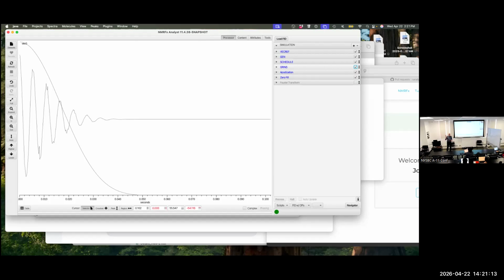So the sampling schedule, again, remember, is not the direct points in the FID, directly detected. Normally you'd collect one FID, increment, delay the experiment, collect another FID, increment another one, and eventually you do the Fourier transform in that second dimension across the points. Here you're basically skipping points that you collect, and there's a cottage industry of people that come up with algorithms to computationally fix this issue, and a cottage industry of people that come up with optimal schedules.